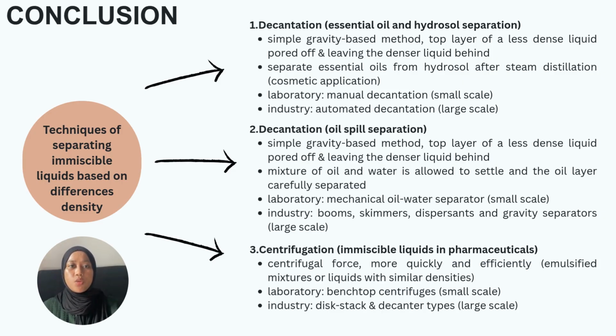Lastly, the study shows that while each separation technique is based on the same core principle, such as differences in liquid density, the choice of method depends on the scale, desired efficiency, and application context. Understanding and applying these separation techniques appropriately enables effective purification, risk reduction, and product quality enhancement across various fields.